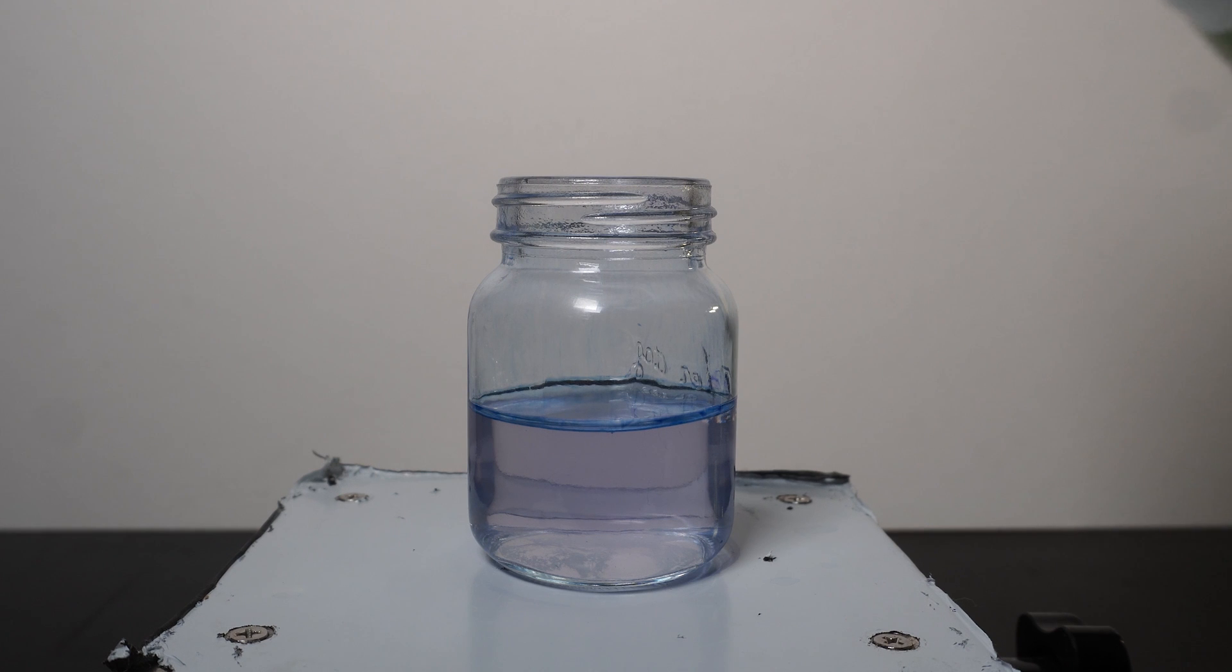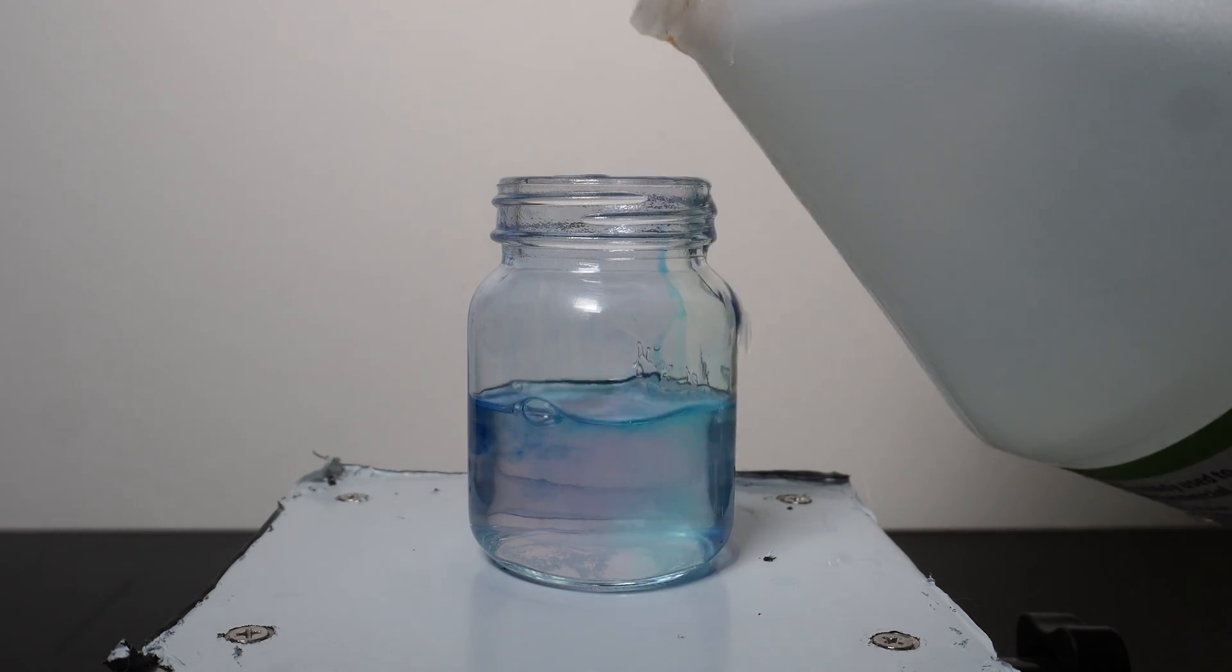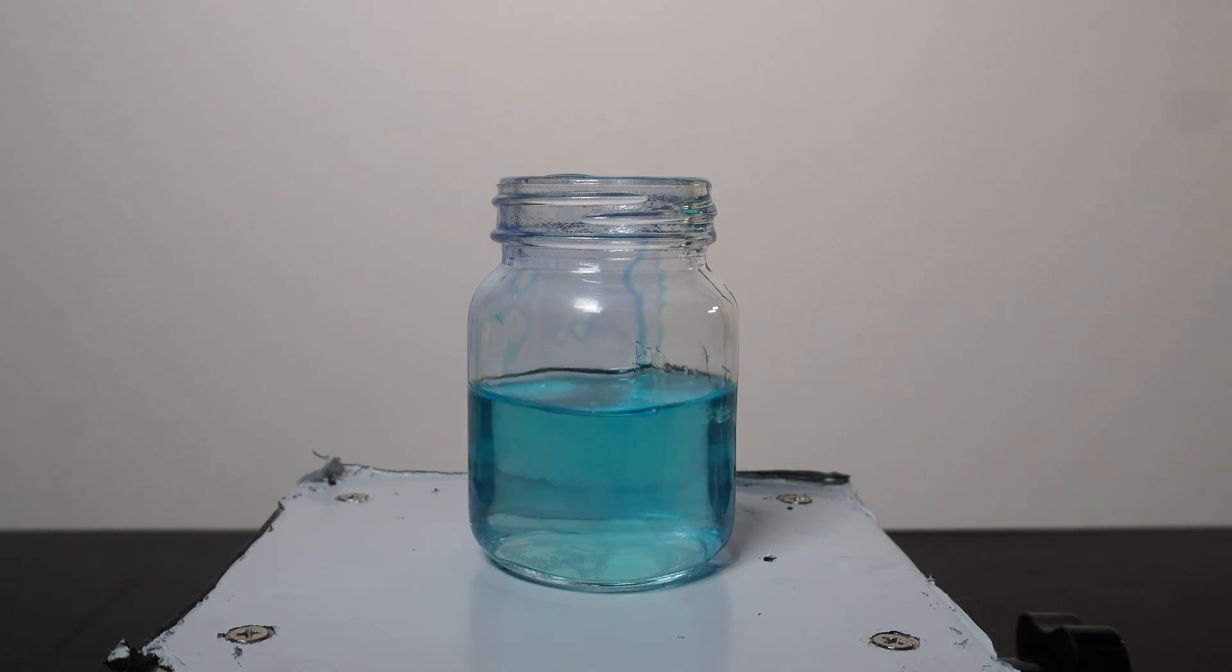To clean this up, we just need to neutralize the solution down to between 5 and 7 pH. To do this, I add in some 30% acetic acid. This creates potassium acetate, which is actually 100% okay to dump down the drain.